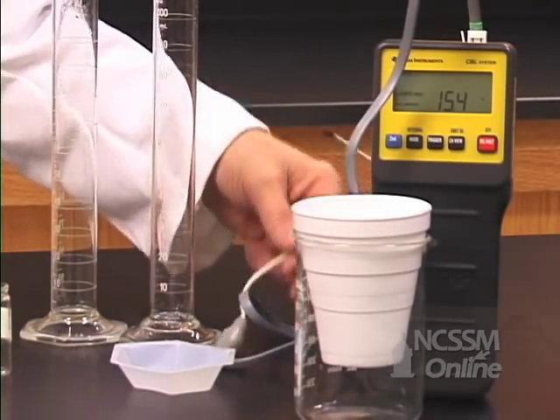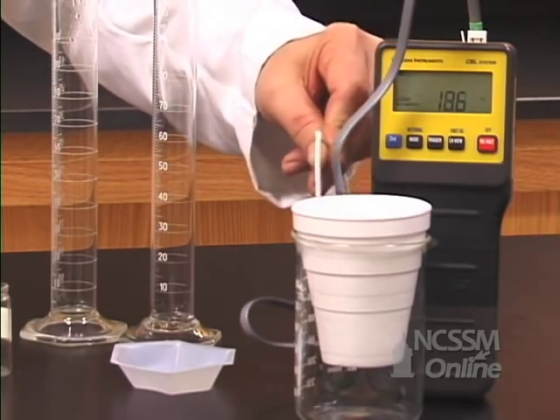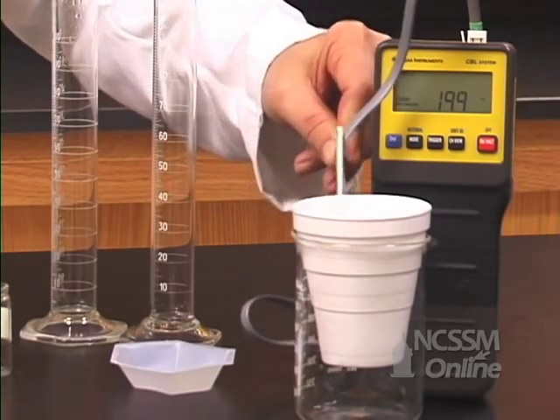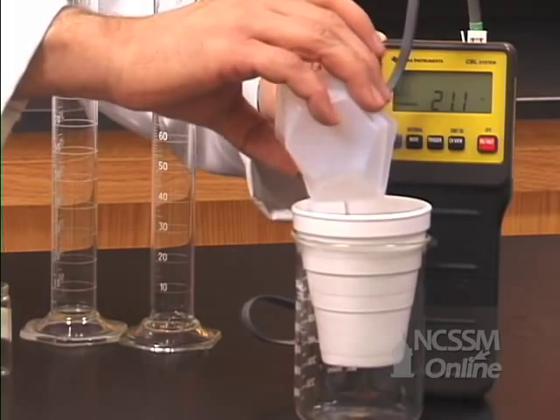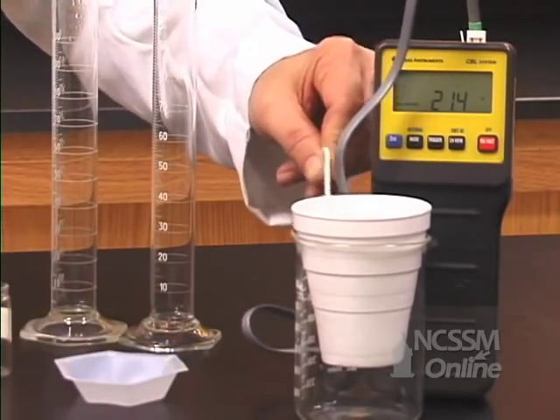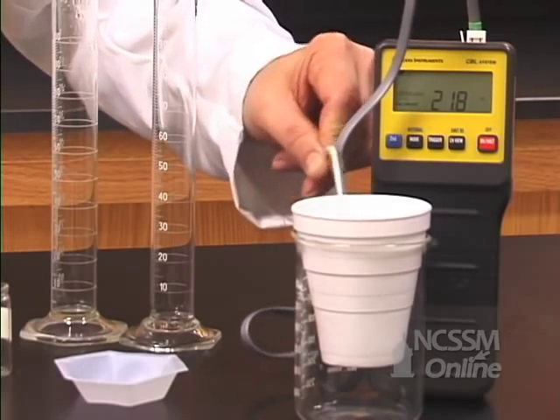We stir the solution and record an initial temperature. We then add the sodium hydroxide, stir the solution, and record the maximum temperature reached.